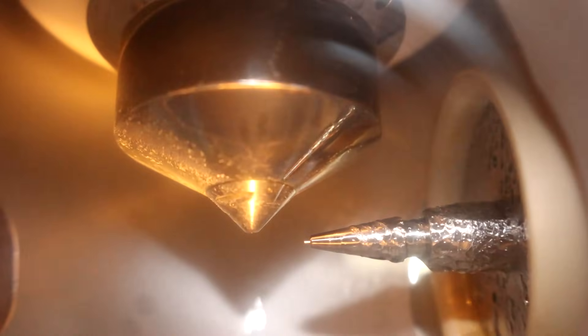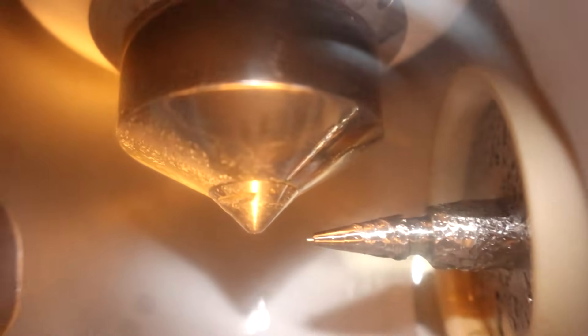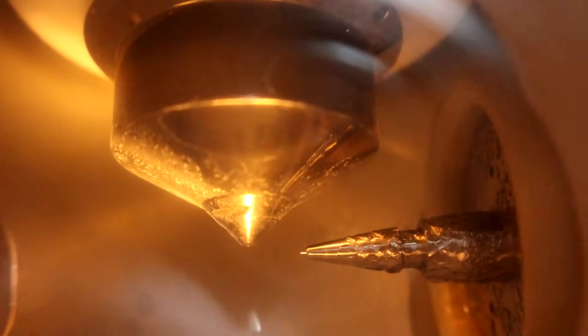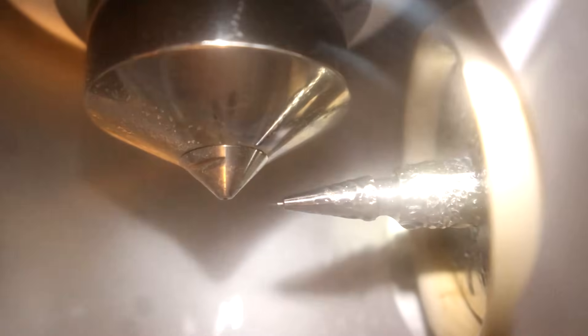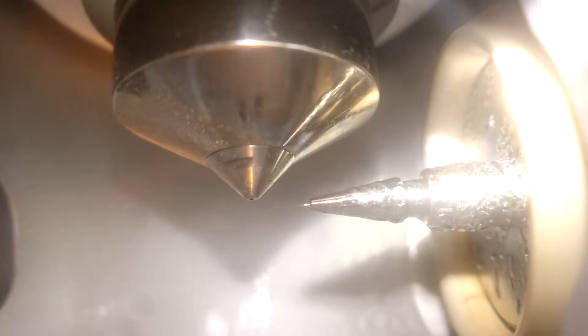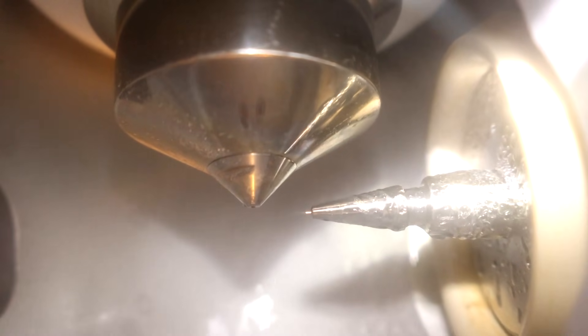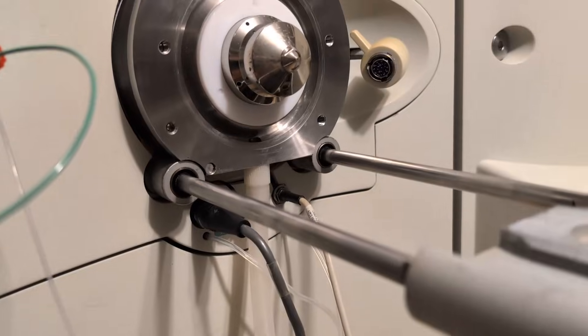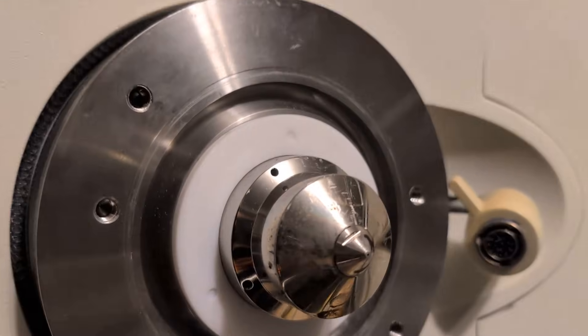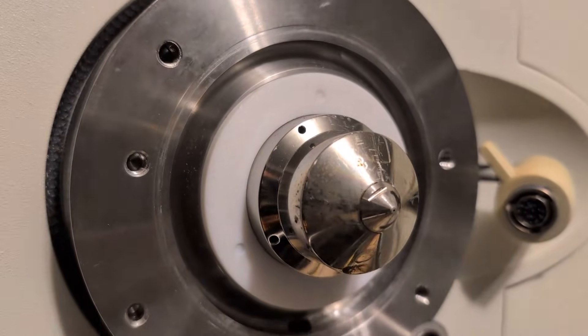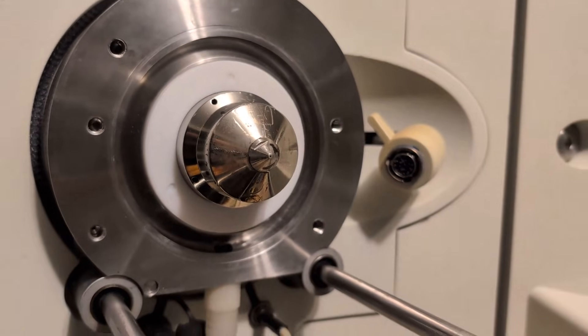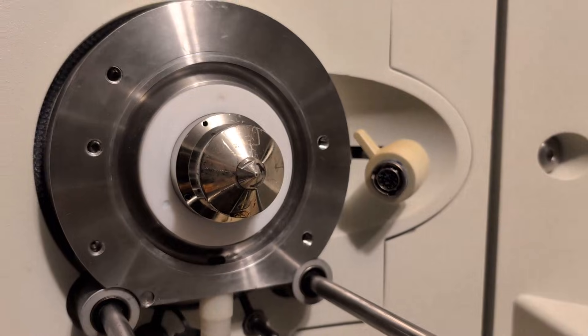In the ESI mode, the sample goes through a capillary tube held at a high voltage of a few thousand volts and is sprayed at a right angle to this cone. Why a wide angle? To limit interference from neutral molecules. The distance from the cone can be set in two axes and the skimmer cone pre-filters the samples for ions to enter into the instrument.